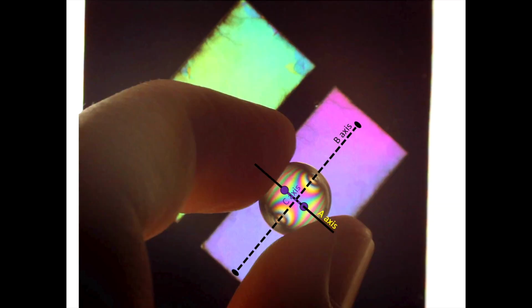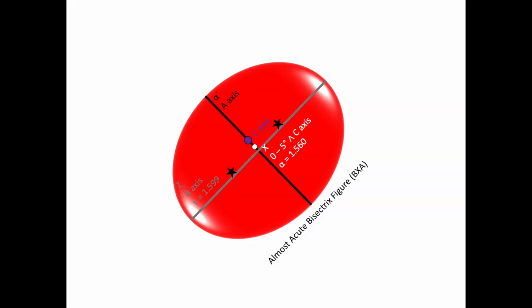There's also a more in-depth treatment of what's going on here in the video, Snellius Minerals Oriented Muscovite Mica Sheet. And moving forward, the interference figure for our lower muscovite plate also allows us to orient it appropriately. Now that we understand the orientation of our muscovite plates, let's go back and focus a little more on interference colors. We'll start back out at our view of our optical indicatrix.